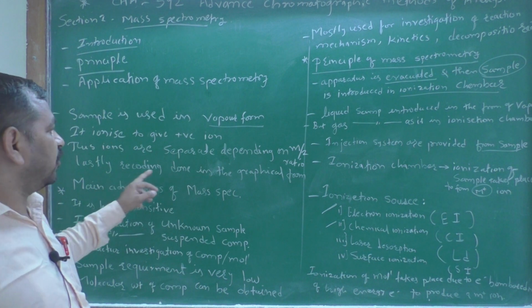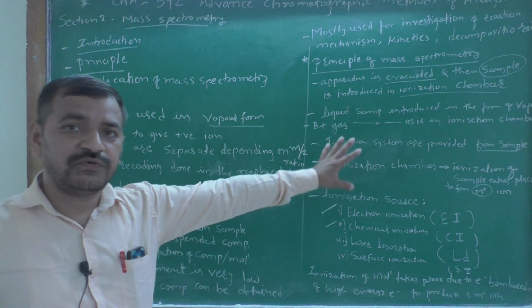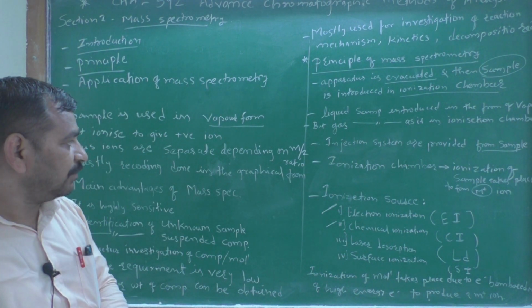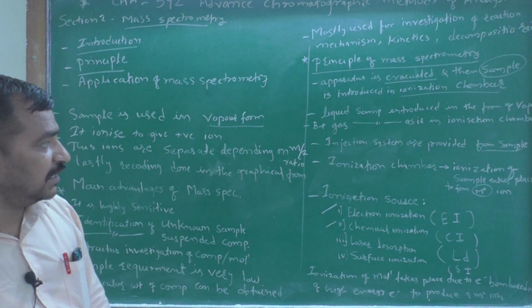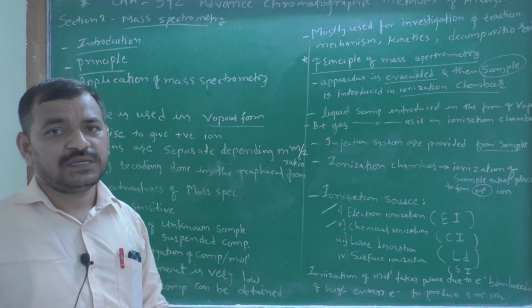The recording is done in graphical form, and then from the graph of mass to charge ratio we calculate the mass of the sample.